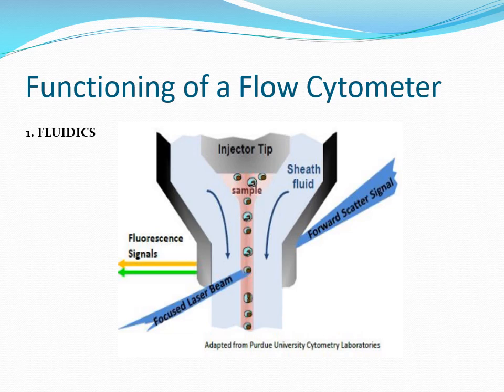Over here, in the population of cells, there are more cells at a single point. They are channelized in the form of a single file. Most flow cytometers accomplish this by injecting the sample stream containing the cells into the flowing stream of the sheath fluid or the saline solution. The sample fluid and the sheath fluid do not mix with each other.